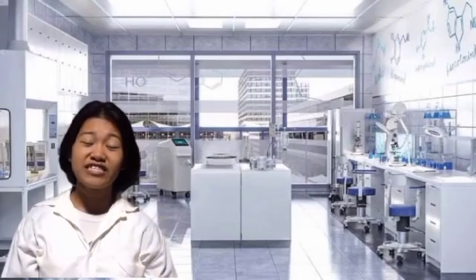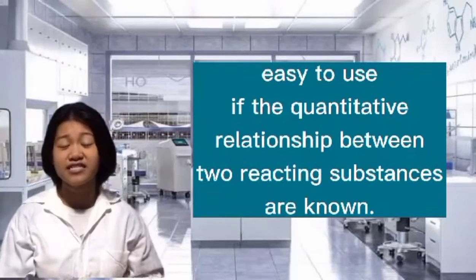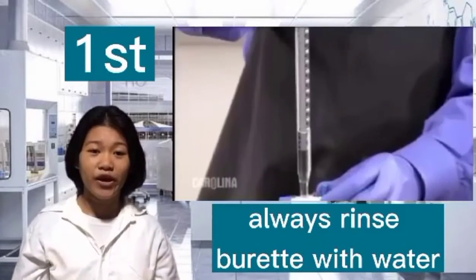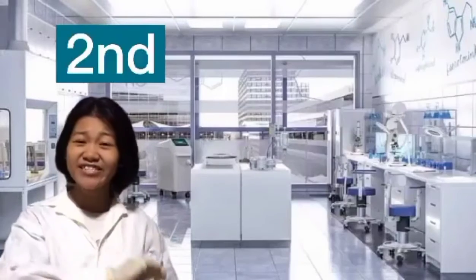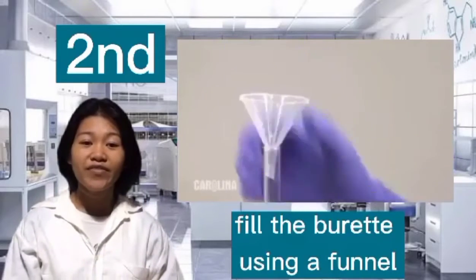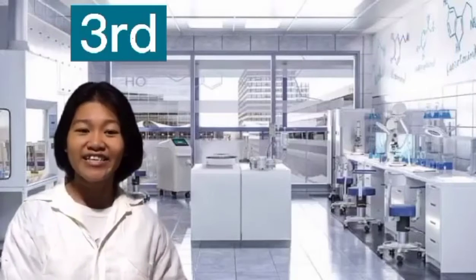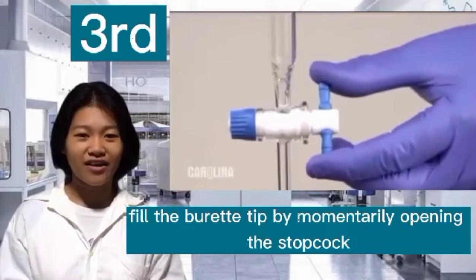Now, let's proceed to redox titration methods and procedures. Redox titration is easy to use if the quantitative relationship between two reacting substances is known. These are the things that should be remembered when doing titration. First is always rinse the burette with water, not from the faucet but from the beaker. Second is fill the burette with the titrant using a funnel. Third is fill the burette tip by momentarily opening the stopcock.